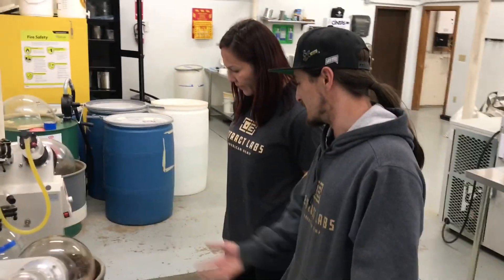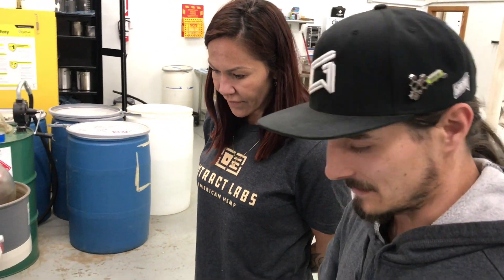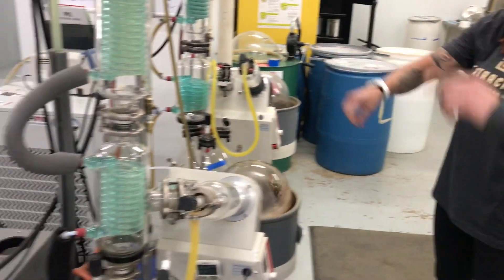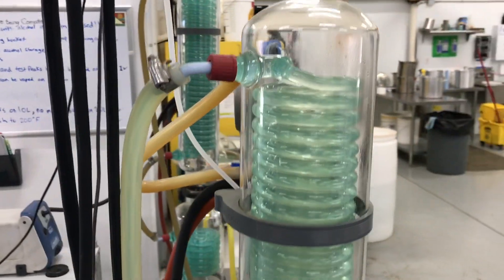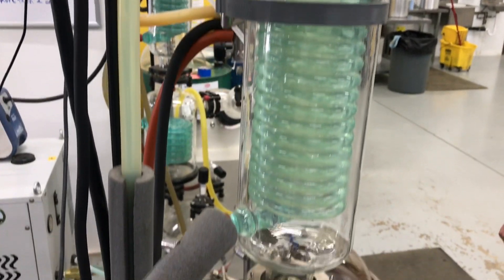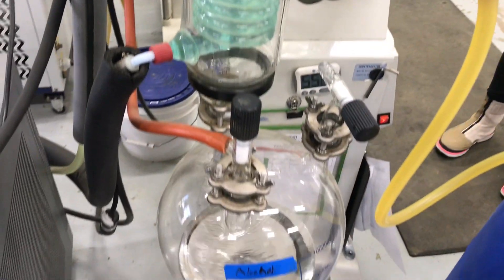So this is vaporizing the alcohol up through these coils and recondensing it right here. It's an alcohol — it takes it from the mixture. And then we can reuse that alcohol as well. That residual oil comes off after, and we can put it in a vapor path.